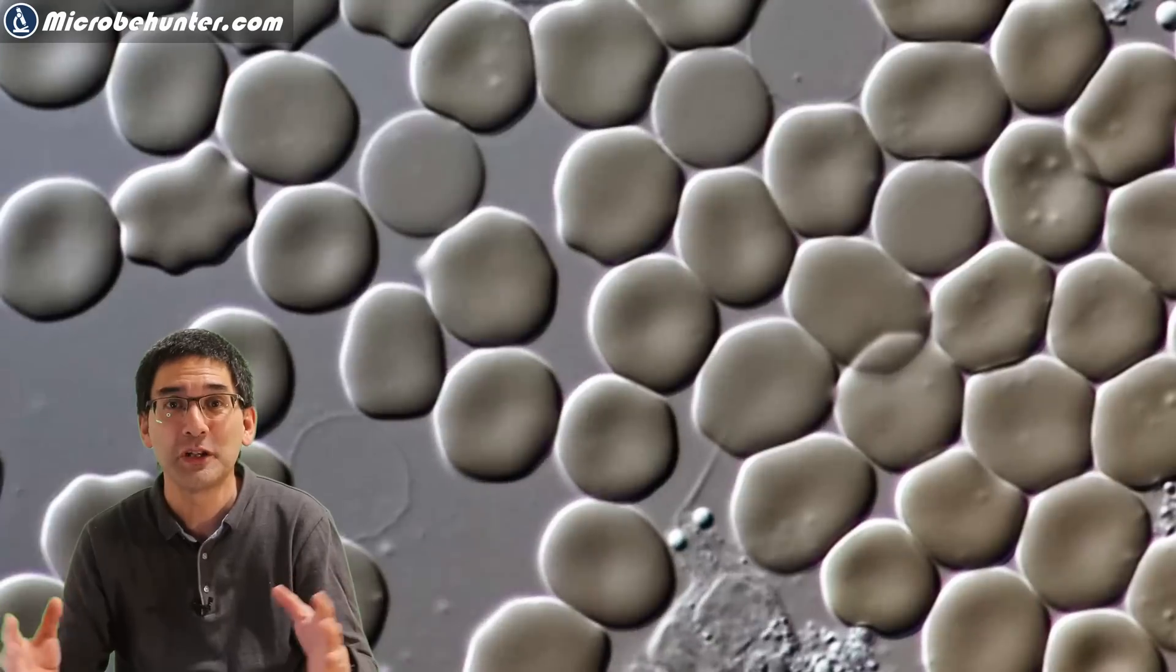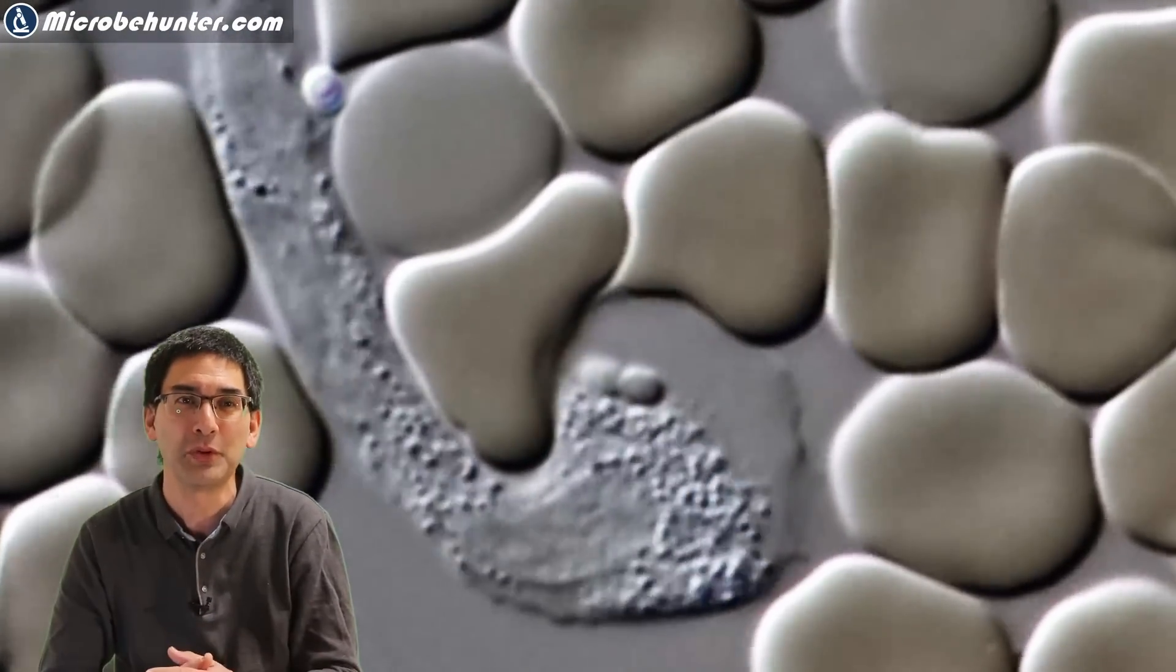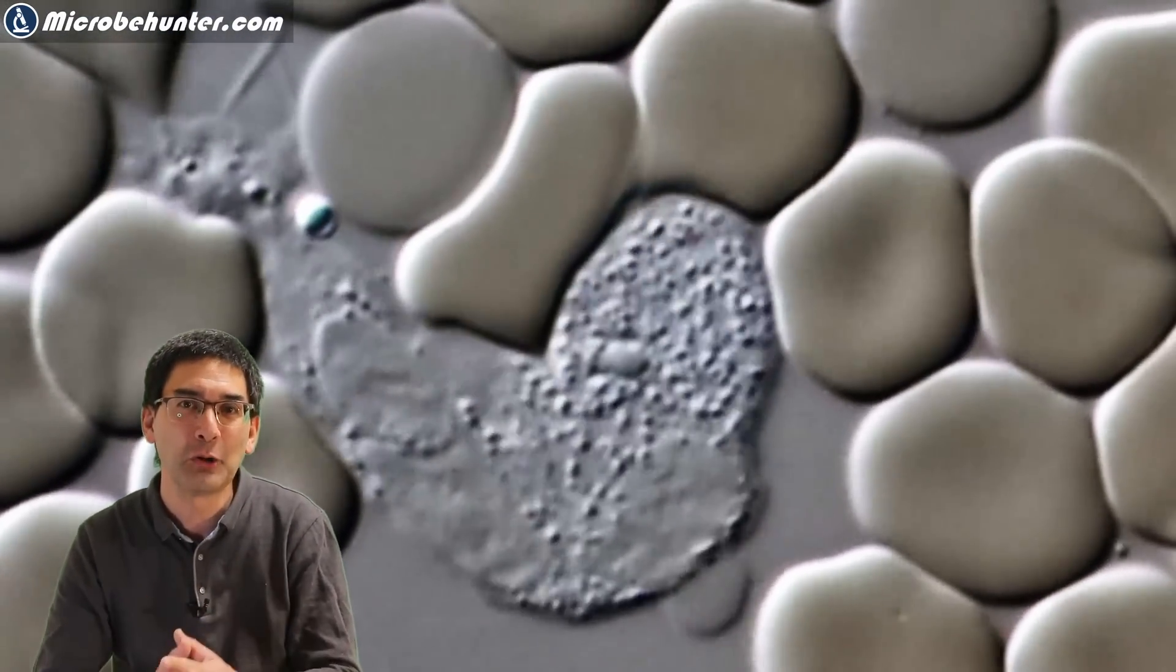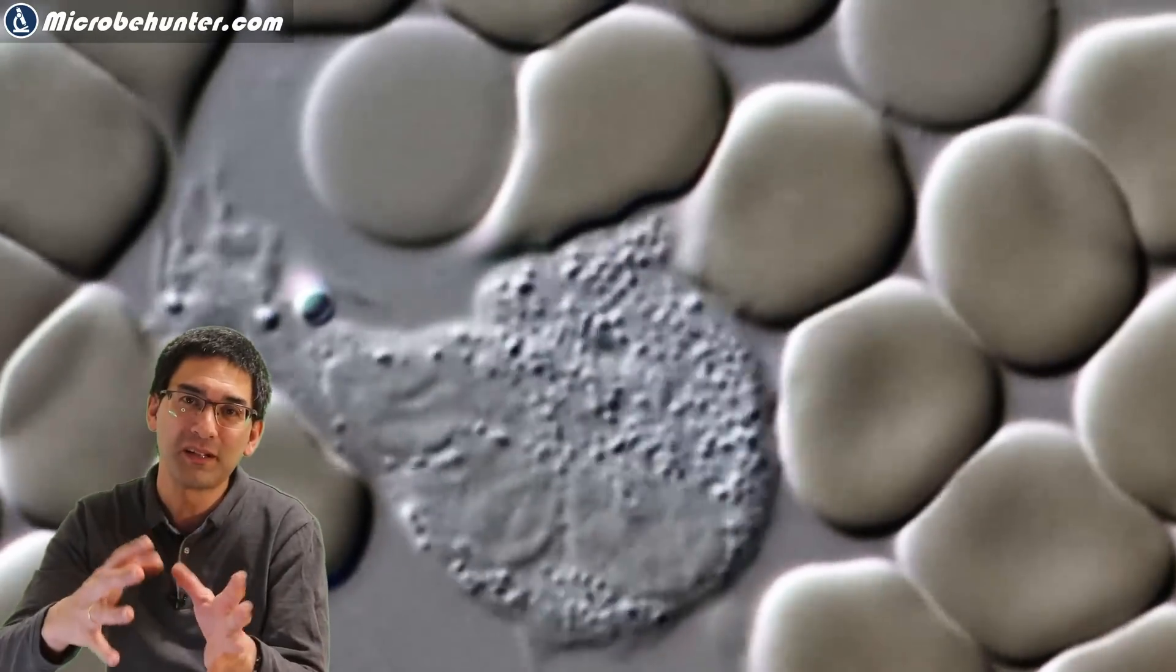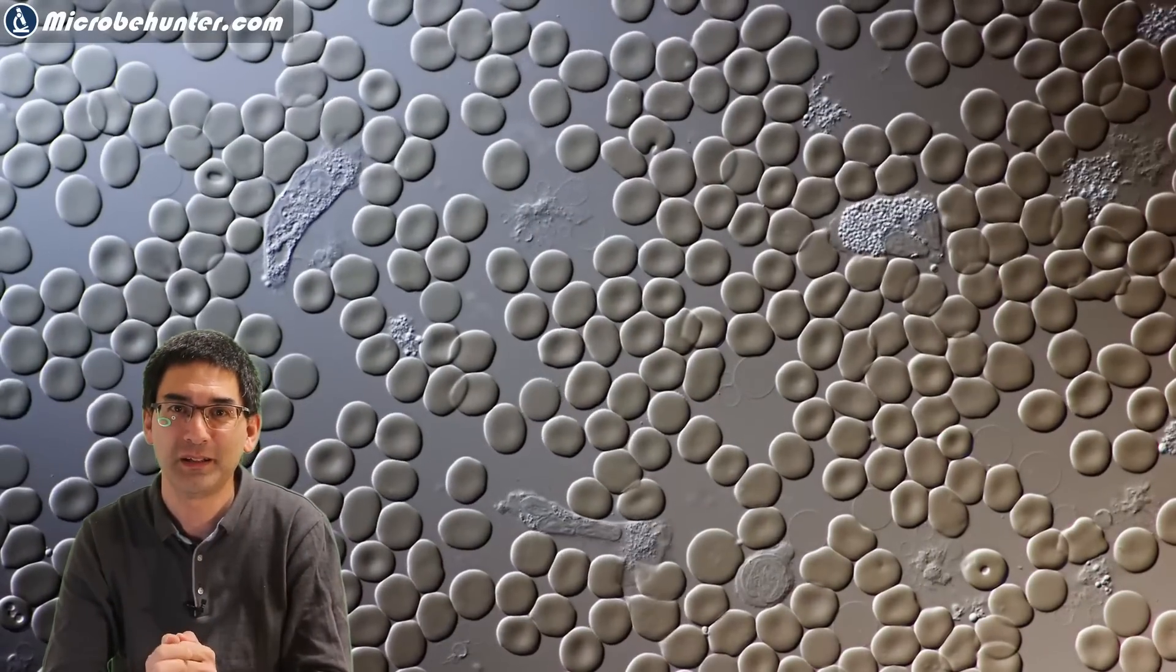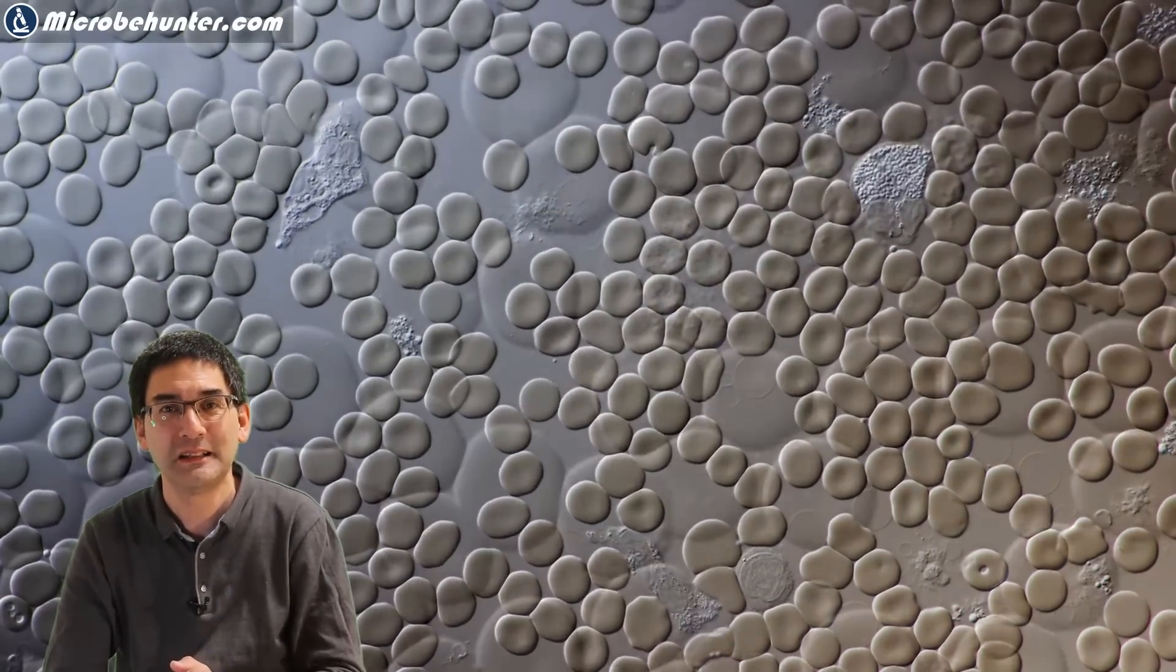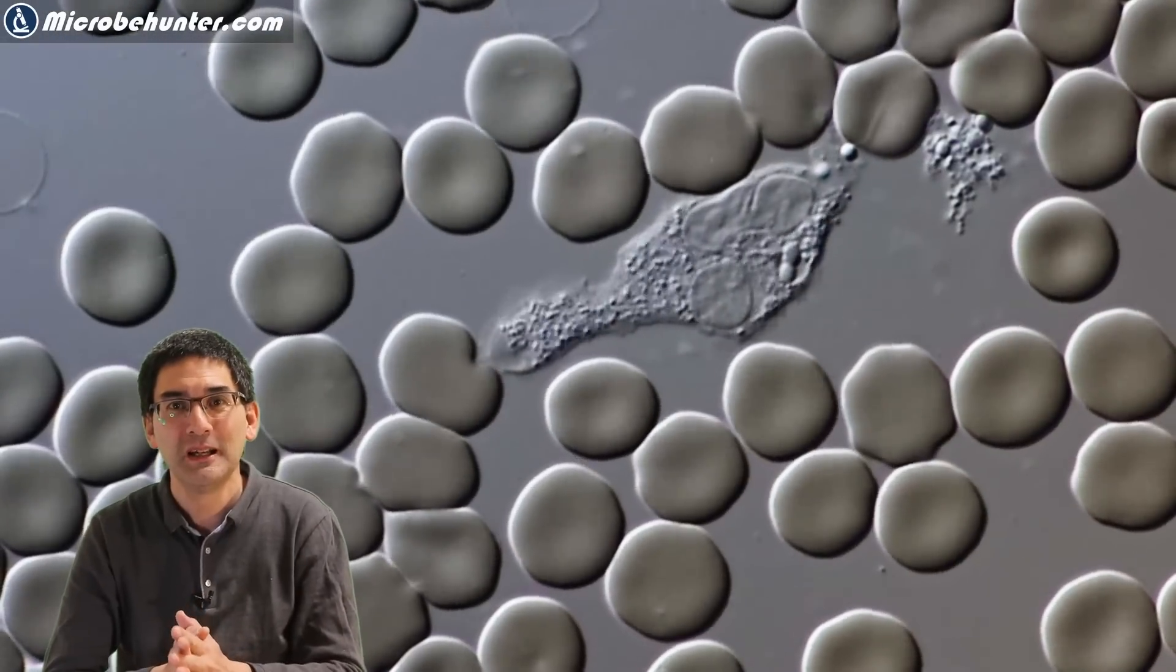They also clean up other things like cellular debris and other things as well, so they are actually those parts of the immune system that kind of clean up the body. Here again, a little bit larger. See, it flows around the red blood cell and is able to then engulf those two little dots that are over there. Very fascinating indeed.